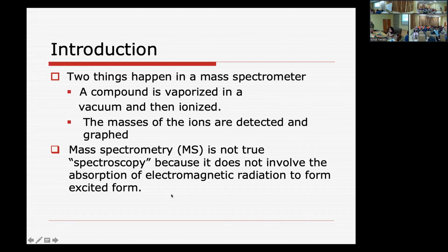Nah, ini ada kata-kata mass spectrometry. Sebenarnya bukan spektroskopi yang lazimnya kita pelajari. Molekul dalam keadaan uap itu dibombardir dengan elektron yang energinya tinggi, kemudian terbentuklah ion organik. Jadi pengertian spektroskopi ini kurang tepat sebenarnya untuk spektrometri massa ini. Kenapa?